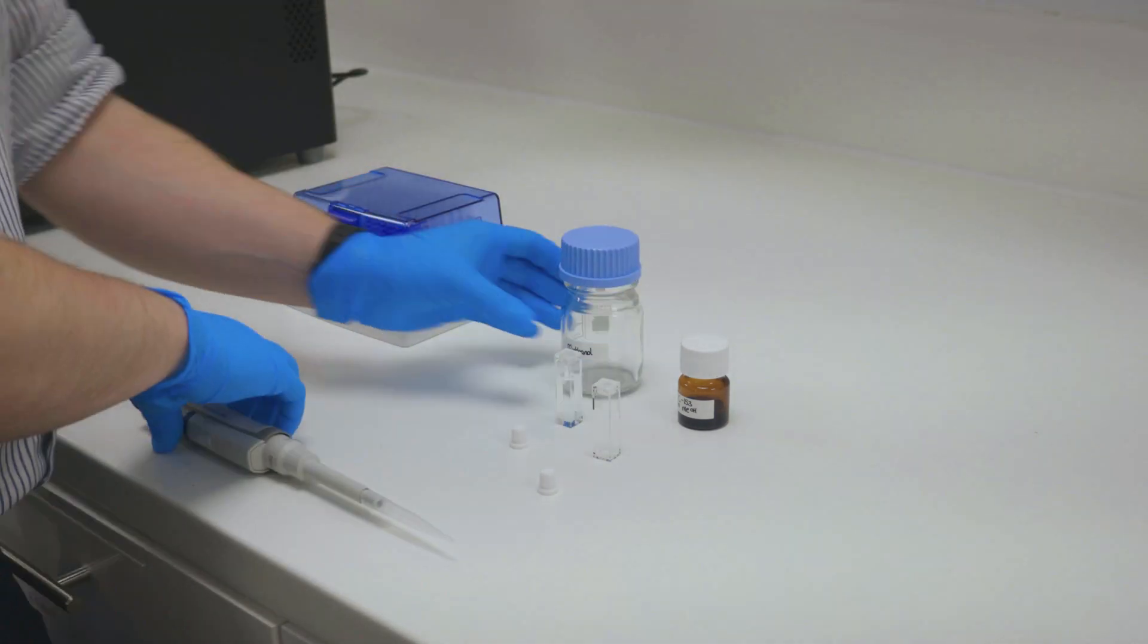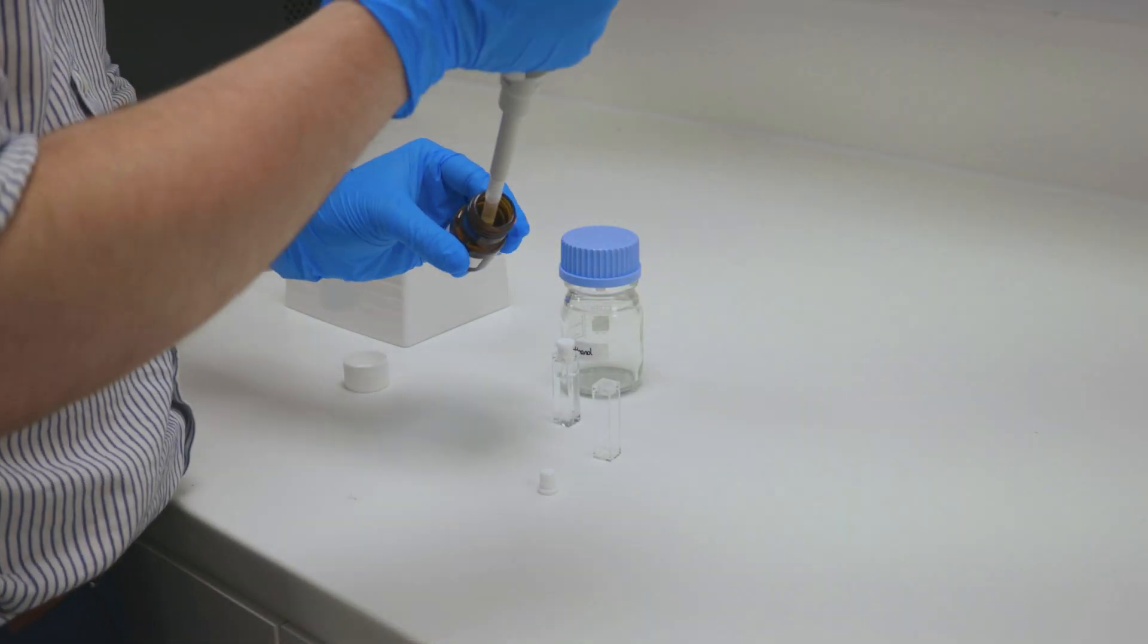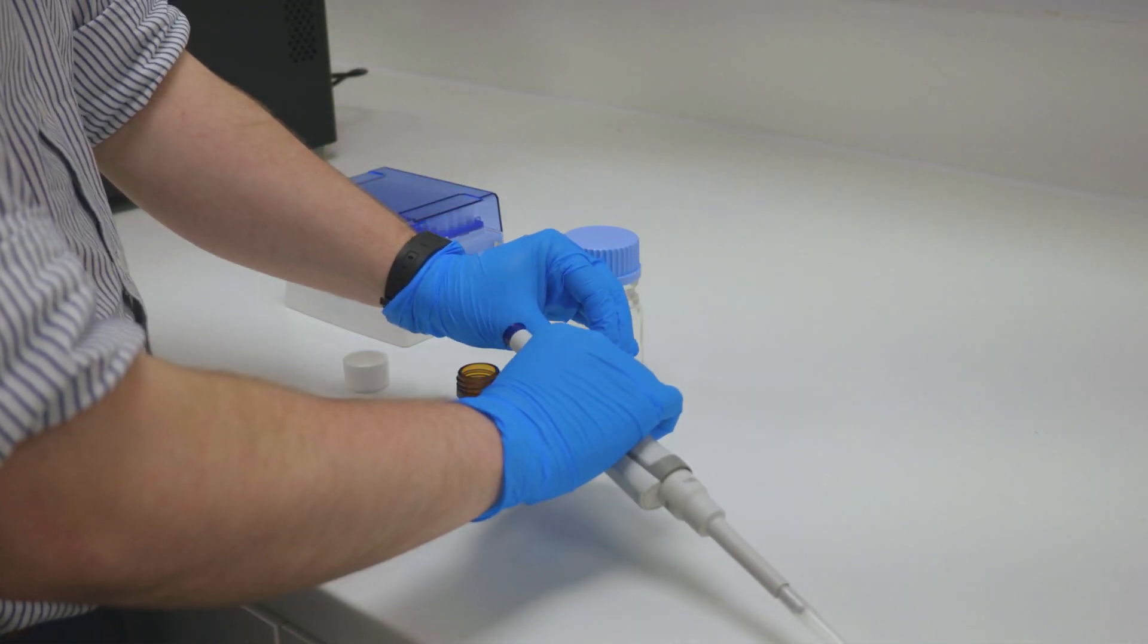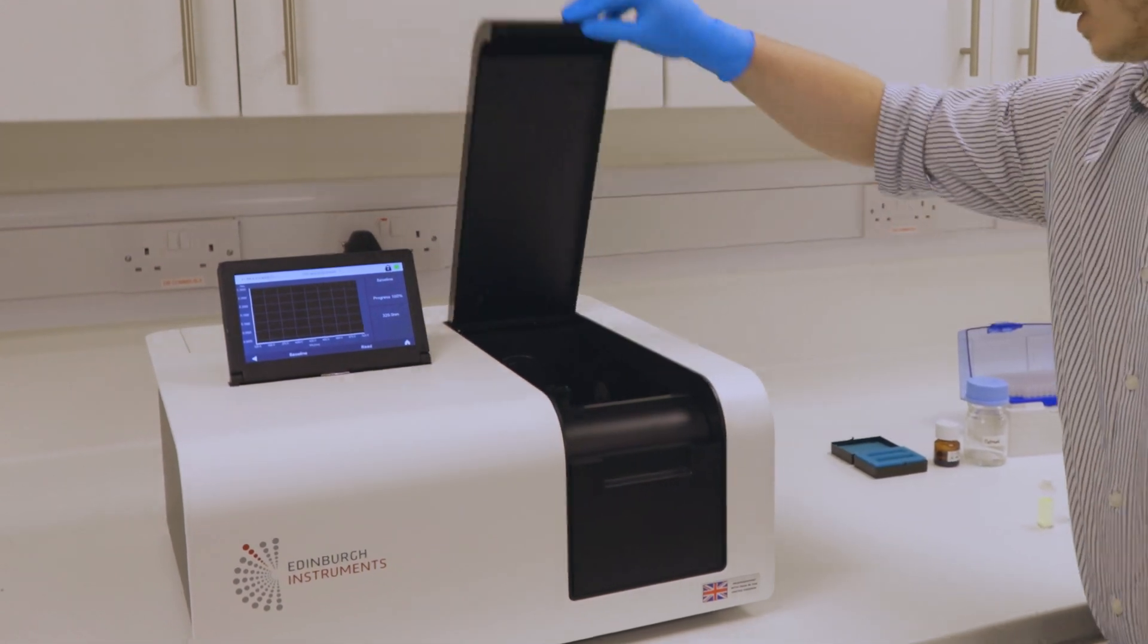I then use the Edinburgh Instruments DS5 UV-Vis spectrometer to determine the absorbance of our stock solution. You can also do this using the transmission detector on your instrument if it has one.